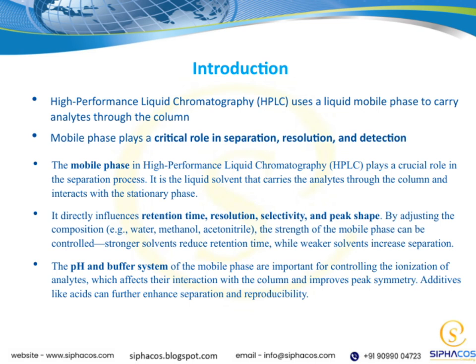By adjusting the composition, say, changing the amount of water, methanol, or acetonitrile, we can control the strength of the mobile phase. A stronger solvent will usually reduce retention time, meaning compounds pass through faster, while a weaker solvent tends to increase separation, giving us better resolution.